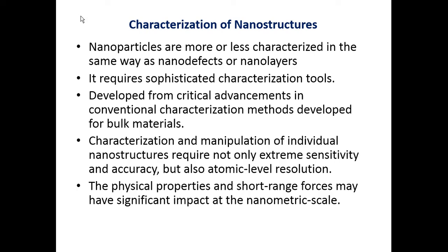My dear students, we have discussed the formation and fabrication of nanofilms and nanoparticles in the second module. So in the third module, we will be discussing the characterization of nanostructures and the characterization tools used for characterizing nanostructures. So what is meant by characterization?